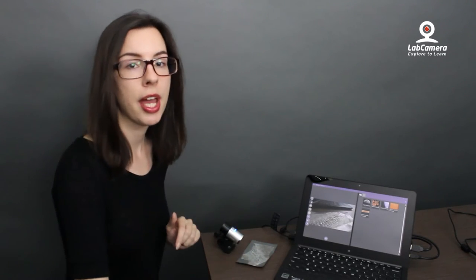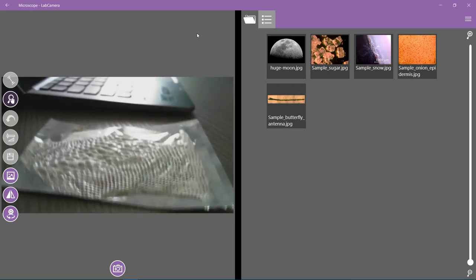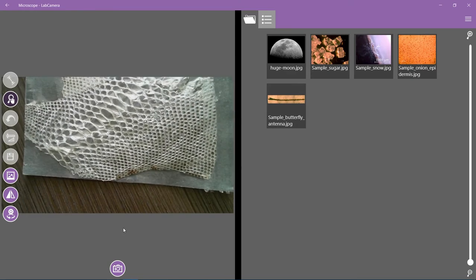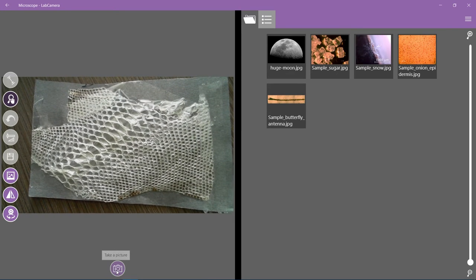But anyway, very quickly, let's have a look at it with the camera. I've already prepared a sample, basically I put a smaller part on a piece of grey paper. I changed the camera to this one and here is the sample. Now I quickly grab this webcam and take a photo from above.